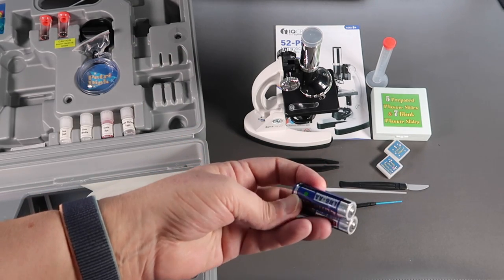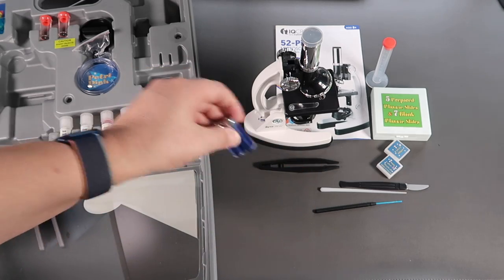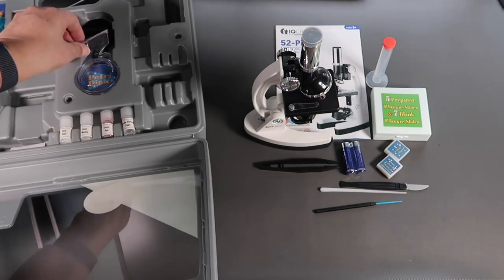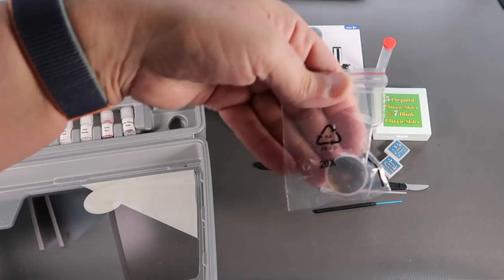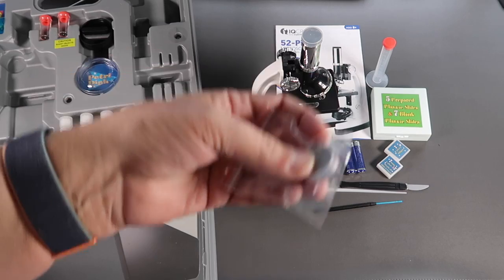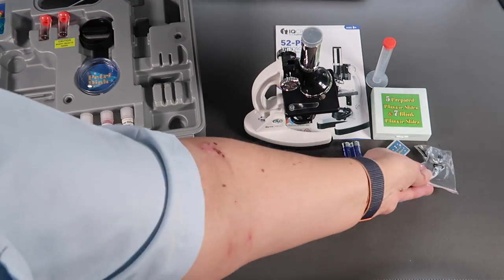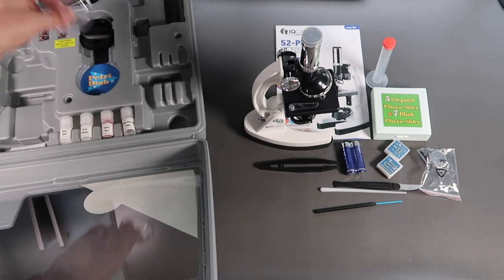Mixing cylinder. Two batteries to power the light in the microscope. It's always good to see when they include batteries. This says 20x. I think it might be a magnifying eyepiece.